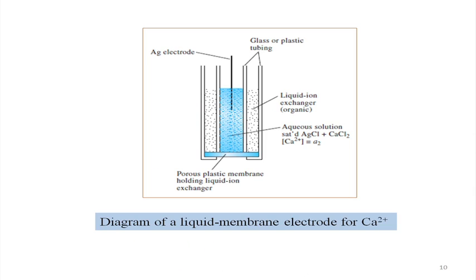This development of the micro electrode is very useful, and if you are able to get a micro electrode of needle shape or size, you can have a needle-like electrode.